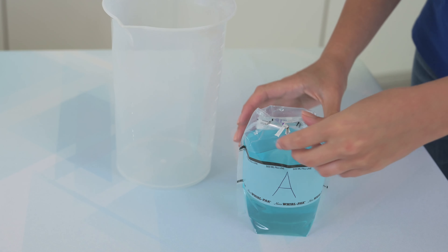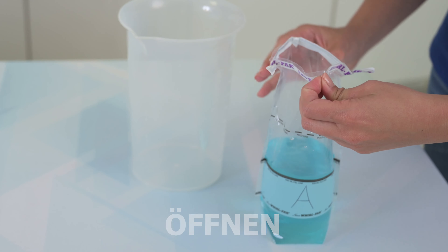And to open, it's just as easy: untwist, open, and collect your sample.